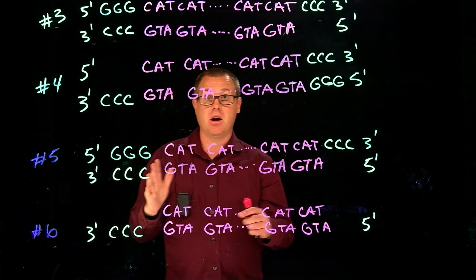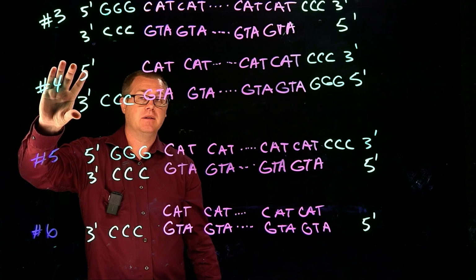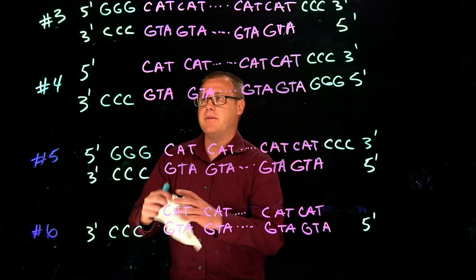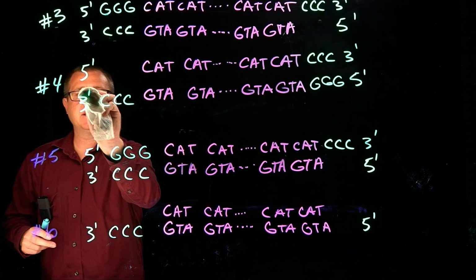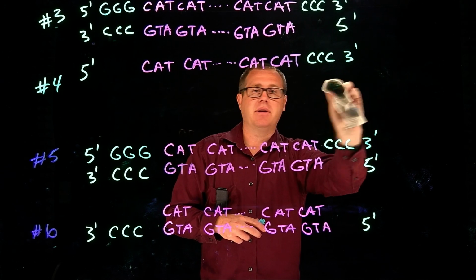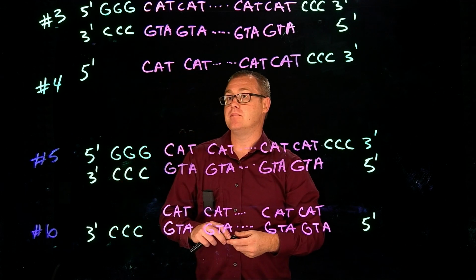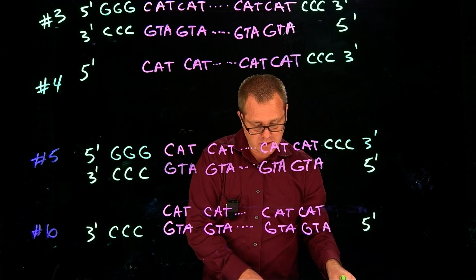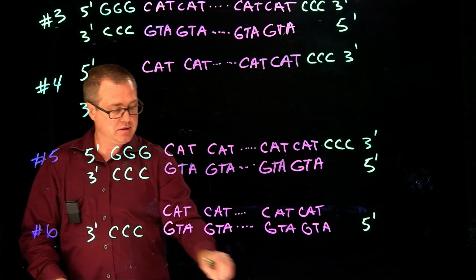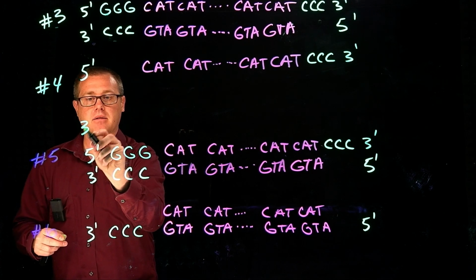we're going to do this all over again now with molecule 4. So to save on space right here, I'm going to take this template strand on molecule 4 and let's denature it and just make it come down here. So what did we have here? We had the 3, let's bring it down here.